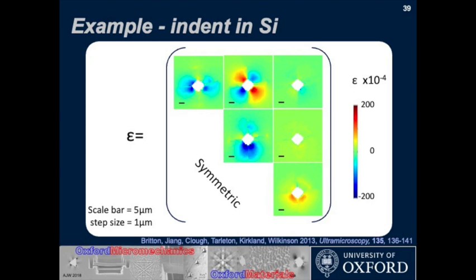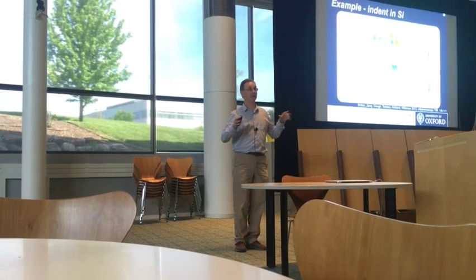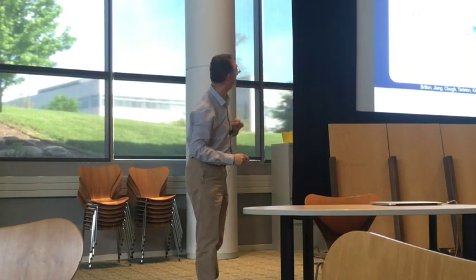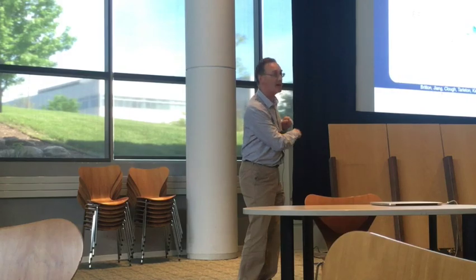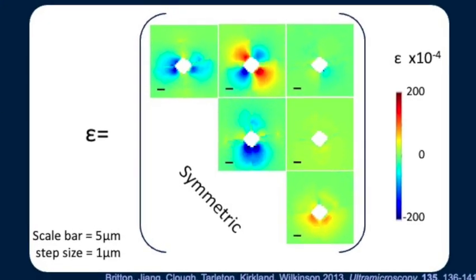So here's the strain along the x1 axis, the horizontal axis in here, which is sort of compressive horizontally. You put a crater, an indent into the sample, it's pushing material out sideways, so you get compression pushing back there. You kind of expect you might get some tension up there above, but there's a crack. That's why the crack's there, so the tension goes away.